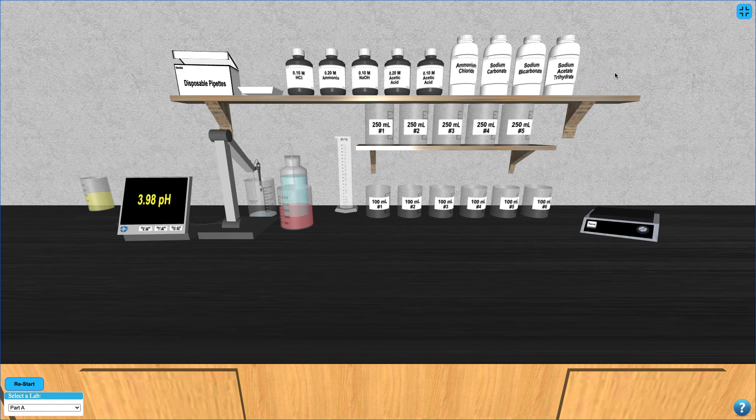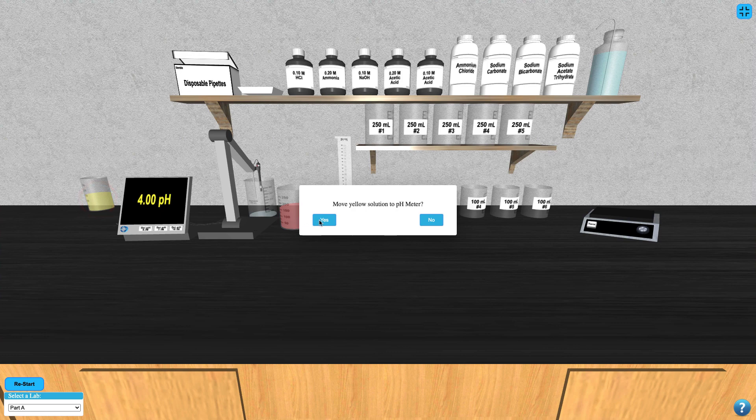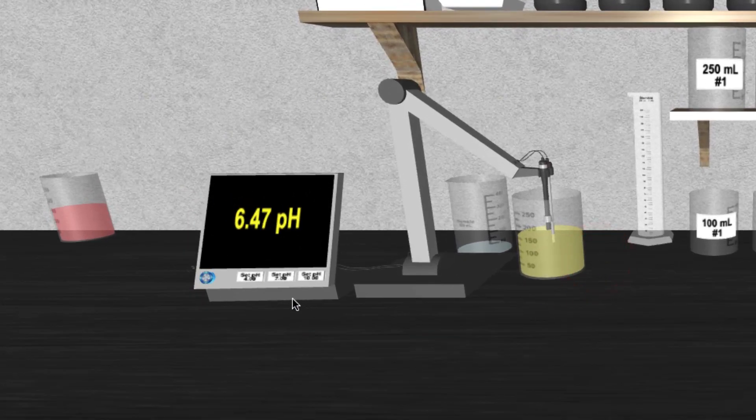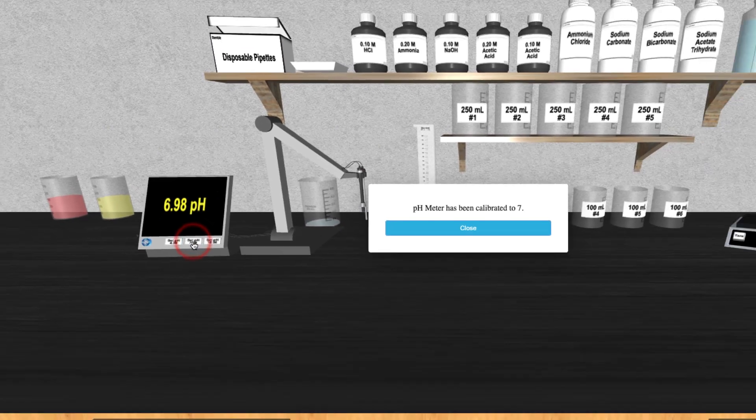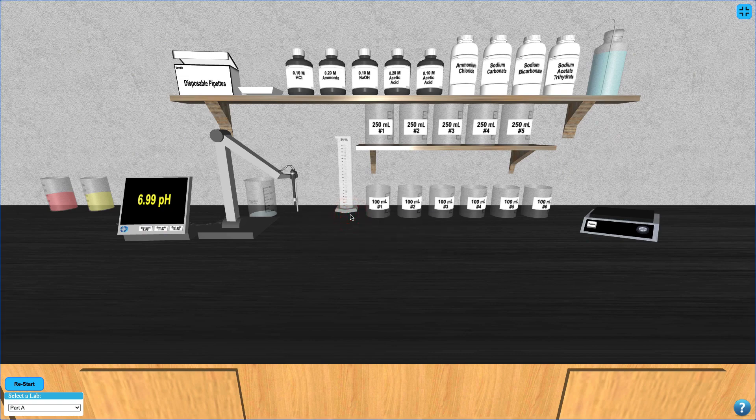Start by rinsing the pH meter by clicking on the bottle of deionized water. Then click the yellow calibration solution to move it to the pH meter and calibrate to pH 7 by clicking the middle button on the meter.